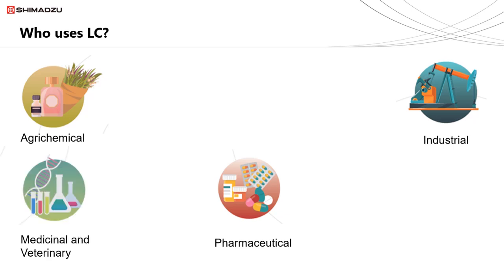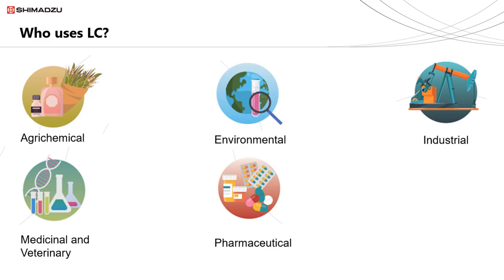Within medicinal and veterinary areas, clinical trial samples can be analysed, veterinary drugs, or even human tissues such as blood, urine, or tissue analysis. Within the environmental industry, it is essential to test soil, water, and even waste streams. Within the food and drink industry, all types of testing is carried out to ensure that quality across products is attained.